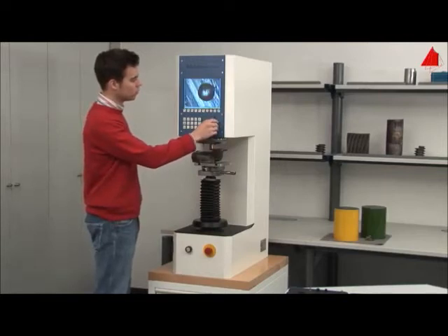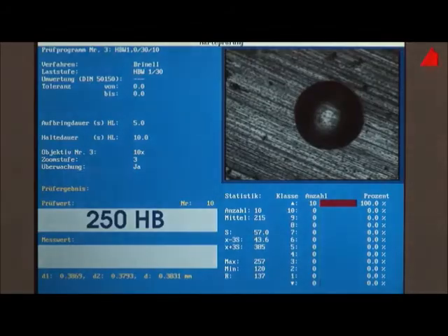The indentation can now clearly be seen on the monitor. With the control knob, the tester places four measuring lines on the edges of the indentation to measure its diameter. The result is displayed on the bottom left-hand corner of the screen and amounts to 250.